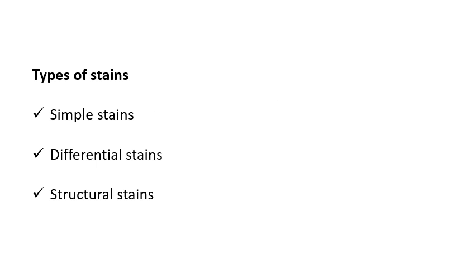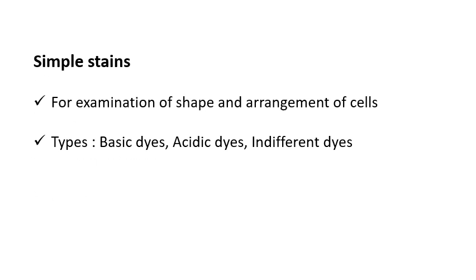There are three types of stains used in the microbiology laboratory. The first one is simple stains, then differential stains and structural stains. Let me explain one by one.